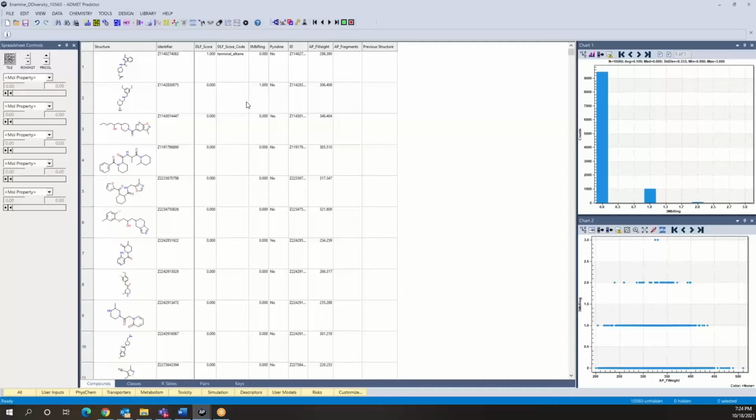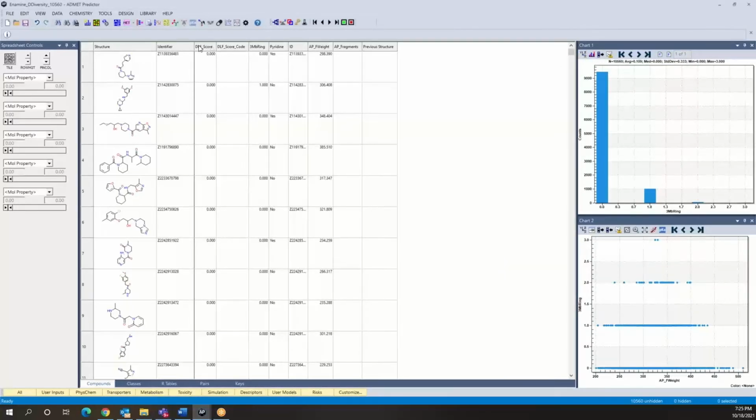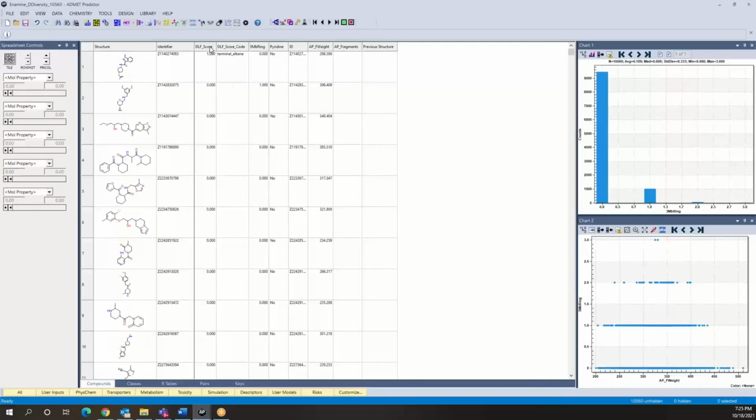And if we want to have access to these compounds, we can follow a similar process to what we've done earlier. First thing is we may want to know what the range is. In this case, the compounds are doing really well, and probably similar rules were applied in the elaboration of this collection. We only have 2 compounds with a DLF score of 2, then we have some with 1, and for the most part it is 0.